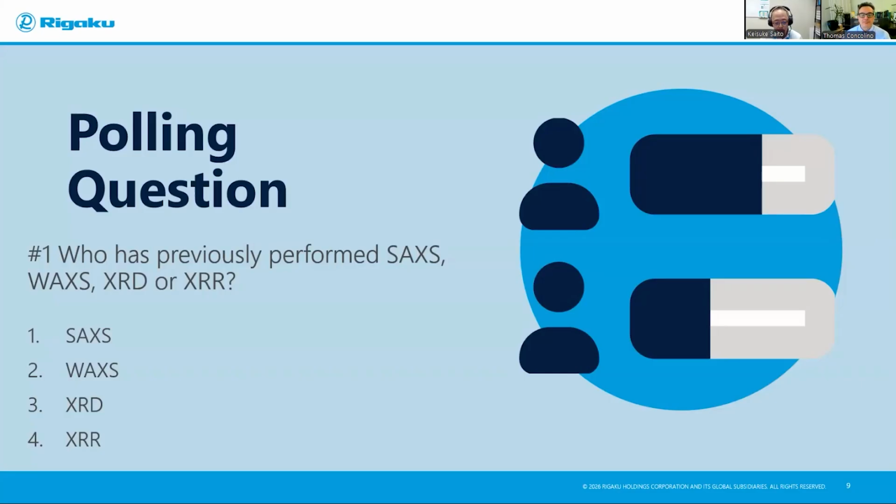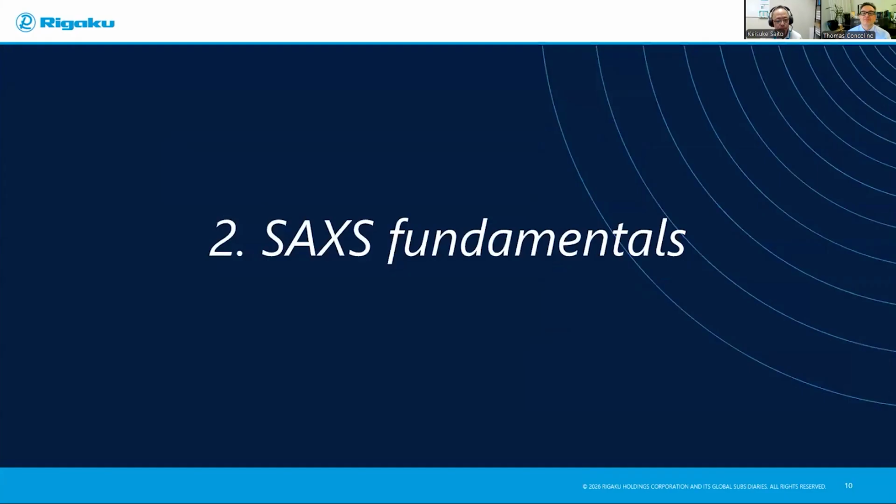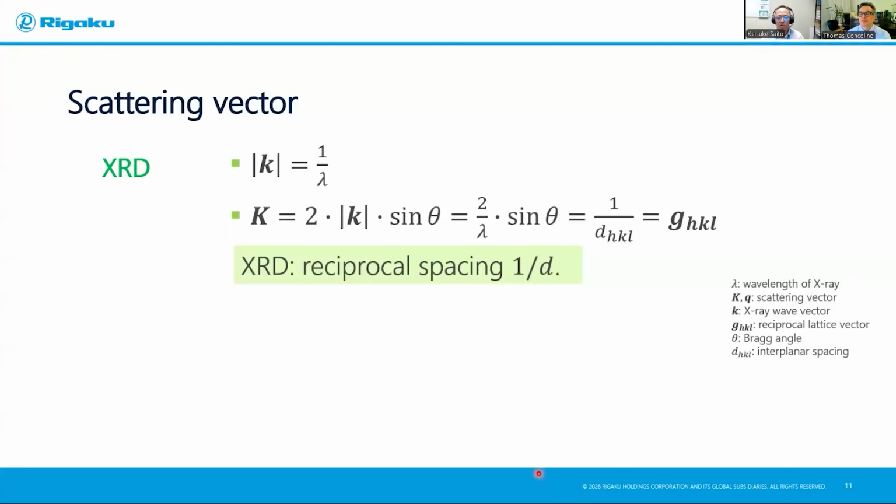All right, so then let me continue. SAXS fundamentals. If you may remember, last time we discussed X-ray diffraction for thin film.